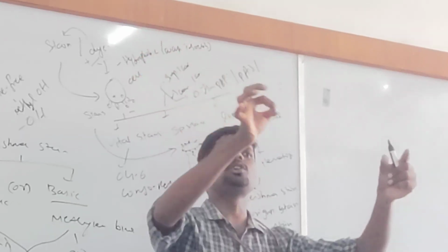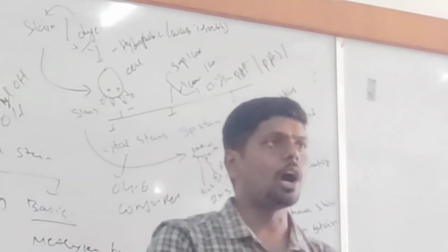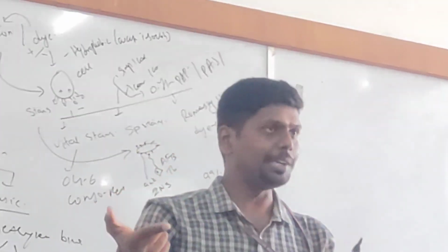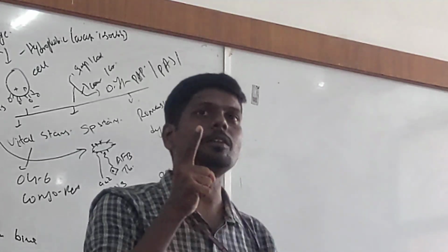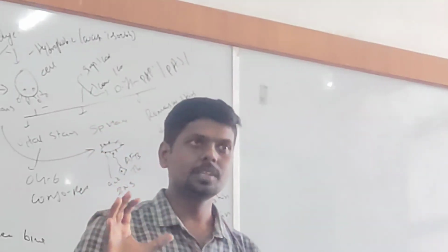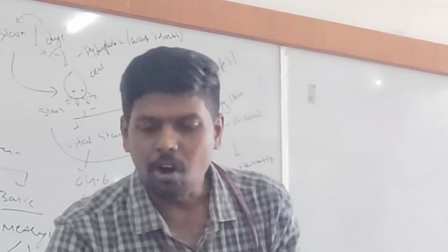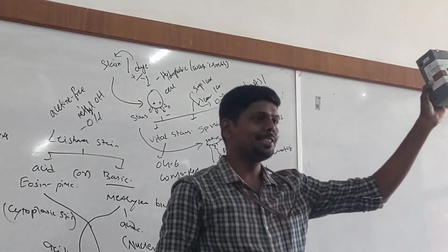Once we add a dye to an alcohol, it will start bleaching it. Of course, alcohol will give charge to the dyes, leading to a stain. But alcohols have a bad property called bleaching. What does bleaching mean? Slowly the color will fade away. That is why these stains will always come in a box like this. They will give a solution.